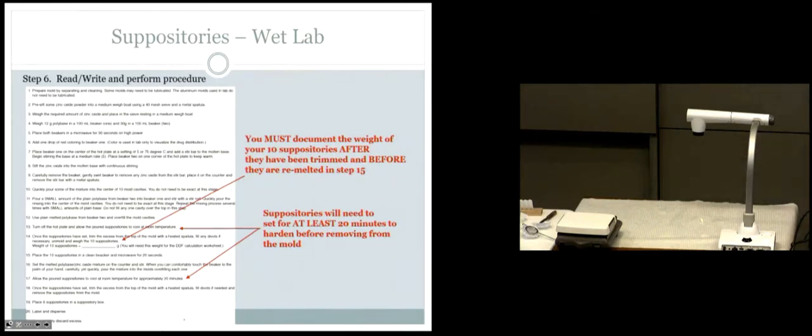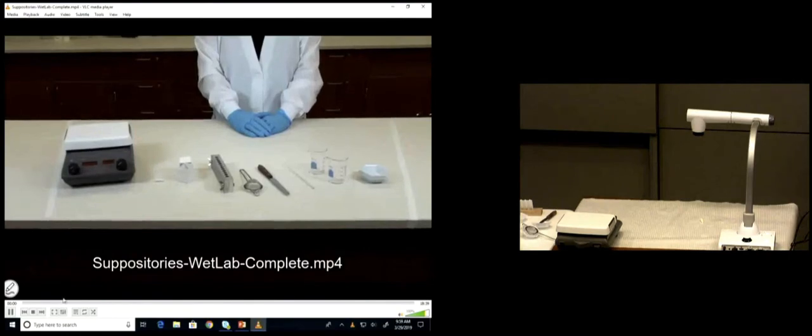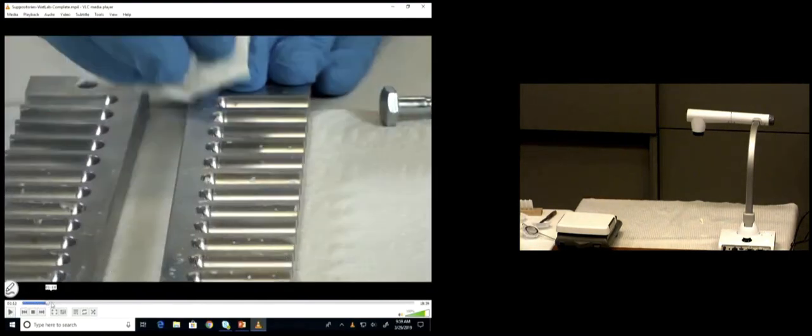Okay? So what I want to do here is I'm hoping and I'm assuming you all watched the video. And I want to make sure to point out just a couple of things so that things don't go really bad for some of you out there. Okay, because this is technically a little more complicated. The required equipment. All right, so do remember out at the stations between you and the person across from you, I've already set a jar of polybase, so you don't have to go to the supply stations, but you have to share with the person across from you. So you've got polybase there.